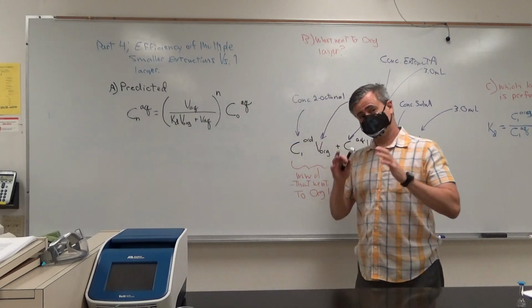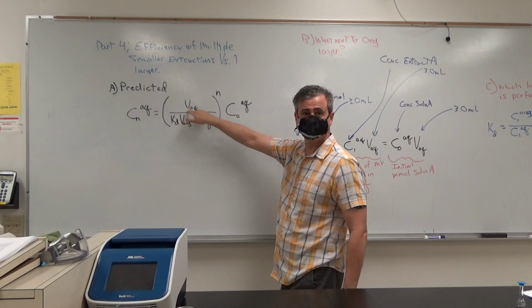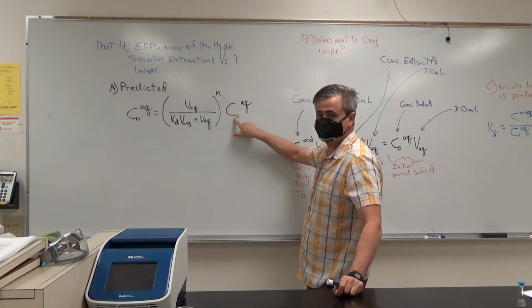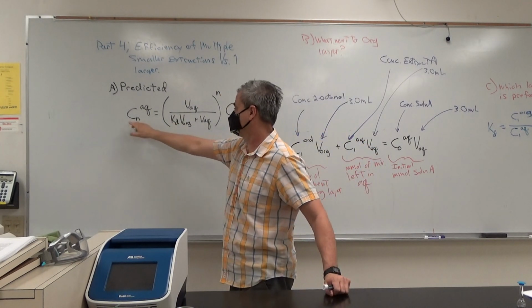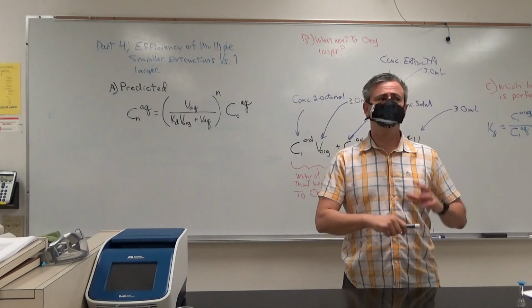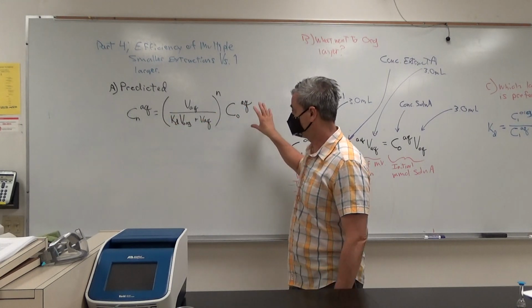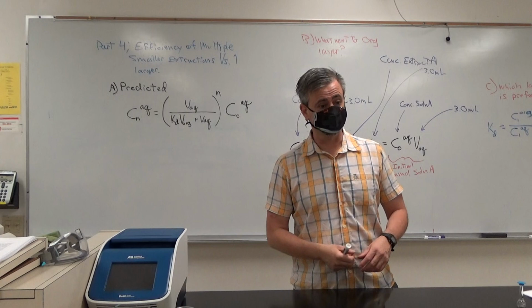So in that scenario, let's think about this. What is VAQ? 3. What is VOR? 1.5. What's n? 2. What's this? The initial concentration. It didn't change. It's the concentration of solution A. KD is KD. And that's how much is left after 2 extractions. By the way, do the calculations at home. Don't slow yourself down by doing them while you're in here. Once at home, when you're doing the worksheet, you will come up with your theoretical value. And then in part 4, you're actually going to do 2 small extractions.